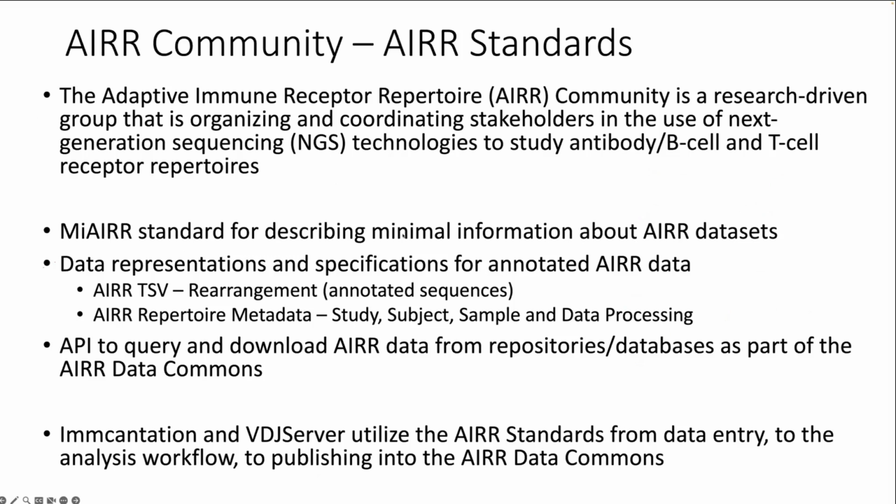Okay, so that was VDJServer. I'm going to now talk about a couple of other resources, in particular the AIRR Data Commons.